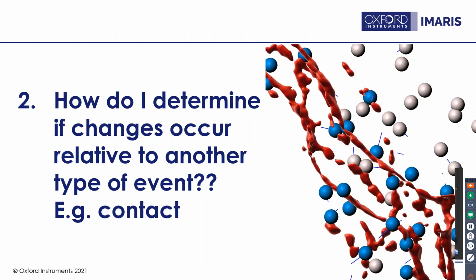So we can extend this idea of events to other changes that we see within our images. If we can detect it, then you'll be able to create these event plots around it. Here is an image where we have parts of a vessel labeled in red. These are the junctions for the cells that are creating the vessel. And then we have other cells that are migrating around it.